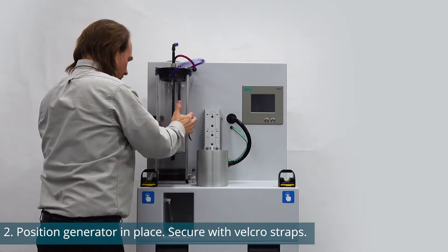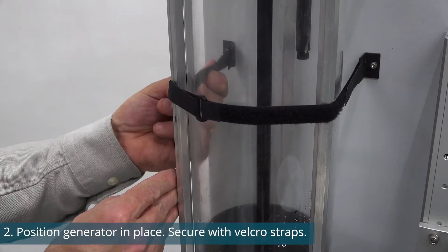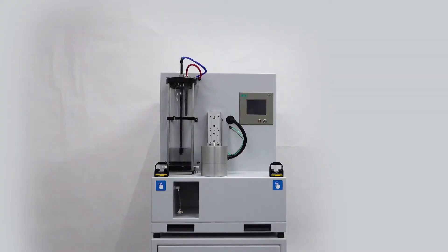Note: if using a salt generator, make sure that the generator is already filled with the appropriate salt water solution. If using an oil generator, the generator can be empty as the replenishment jug will automatically fill the generator with oil.